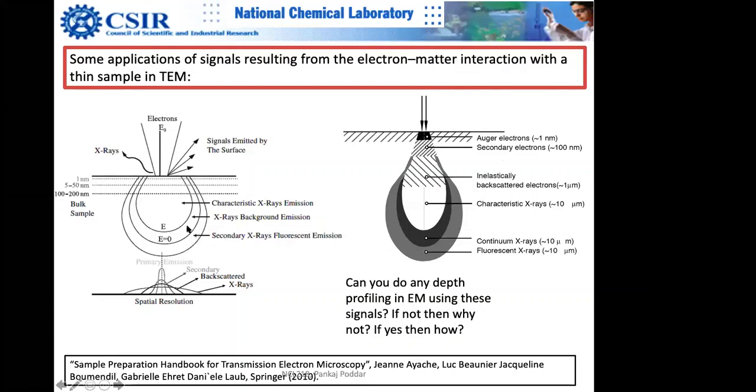So that decides basically, and also there are complexities such as the atomic number and the crystallinity that decide the lateral spread. This is very important because this spread decides the resolution of different techniques. So resolution is not decided just by the instrument, suppose you are doing scanning or transmission, it is decided also by your sample, okay?